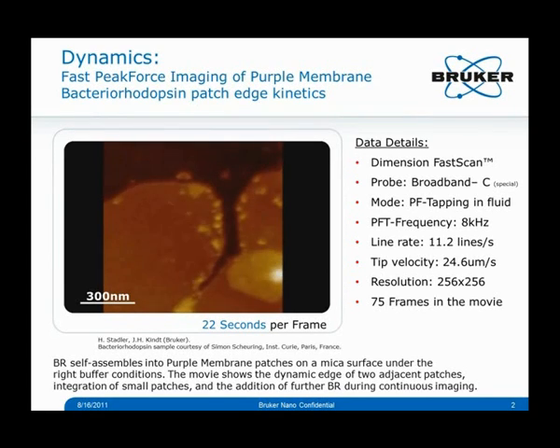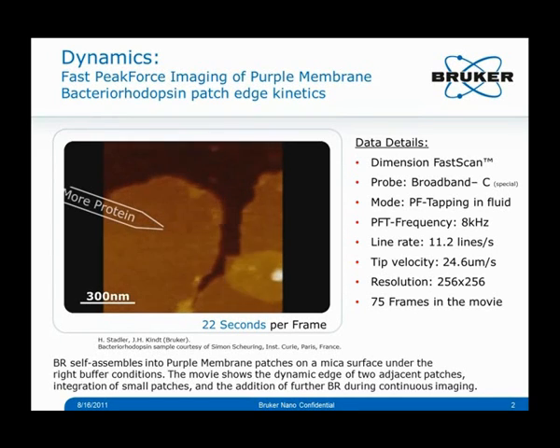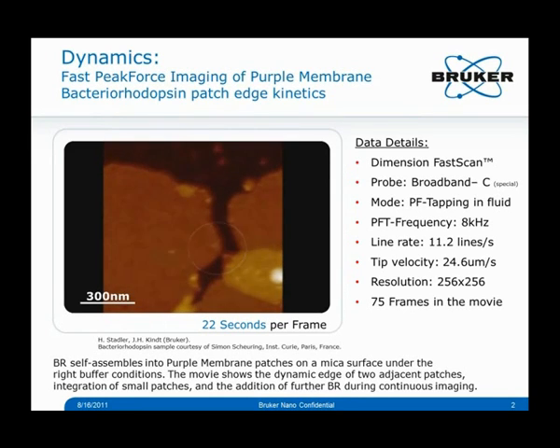And then the next thing we did to make it a little more interesting is after a certain number of frames we injected a little bit more of the purple membrane solution right now. And right now you're starting to see extra proteins appearing, and they're sort of sitting on top of the patch. Well, let's start this over. Here comes the extra protein, and what's interesting is that they seem to collect on top of the other patches, but they don't necessarily self-integrate.